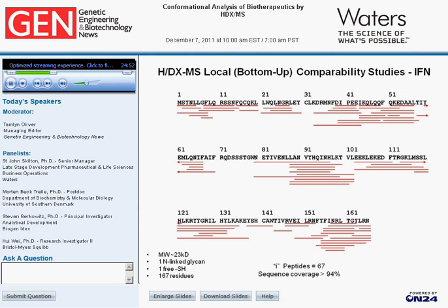But one of the things you notice is that there seems to be a lot of overlap, which you might think is a sort of waste of information, but that actually turns out to be very important for redundancy, for the accuracy of what you're getting in data. Also, it's capable of being used to provide higher resolution information. Hopefully, in the near future, using the electron transfer dissociation process, these peptides can be further cleaved, and we can actually approach one amino acid resolution, but that's in the near future. Next slide.